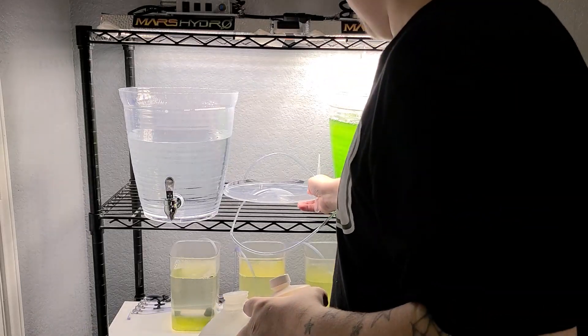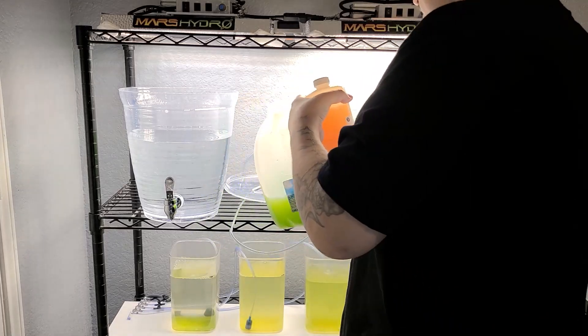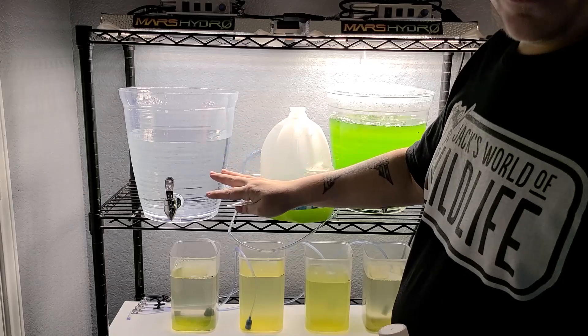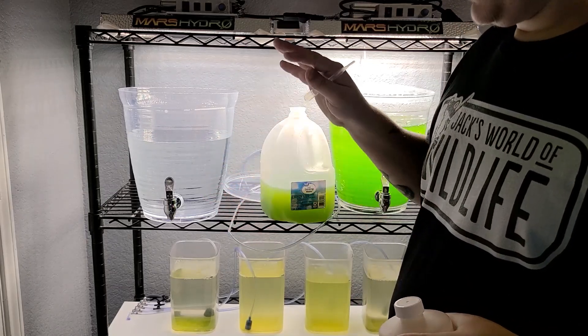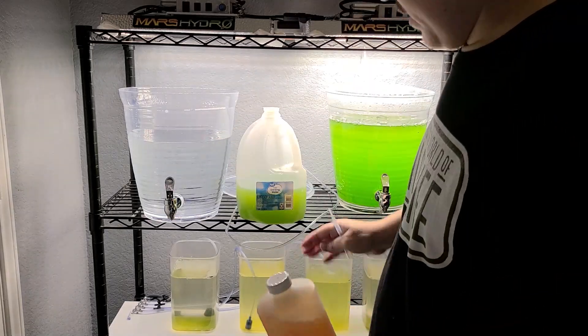I just added some saltwater in there at 1.023 salinity. You can pretty much do a range of 1.020 to 1.026 — that's completely fine. I have it at 1.023 because I use that water to change out one of my clownfish grow-out tanks.